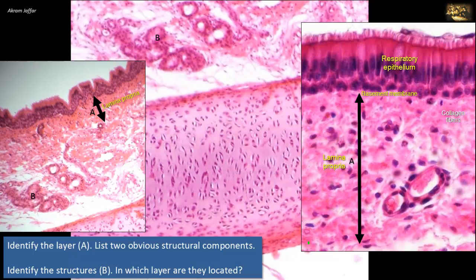It is also highly vascular. You can see a venule and a small arteriole here lined by flattened endothelial cells. There is also a diffuse lymphatic tissue indicated by lymphocytes with their rounded nuclei. Plasma cells might also be seen, and sometimes lymphatic nodules, which are not shown here.